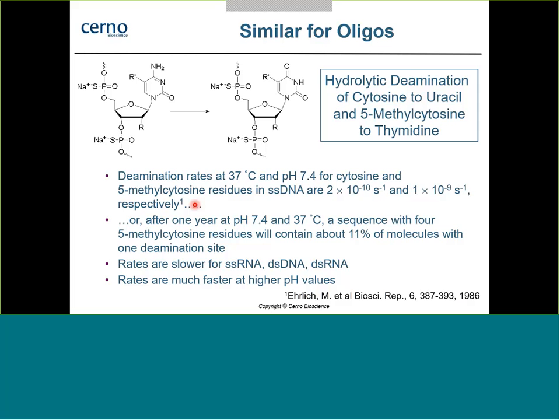Similarly, you can perform this kind of analysis with oligos as well. Deamination here is pretty similar. I'm not going to really get into this today, but really the same principle can be applied to the degradation of a lot of biologicals as well as small molecules.